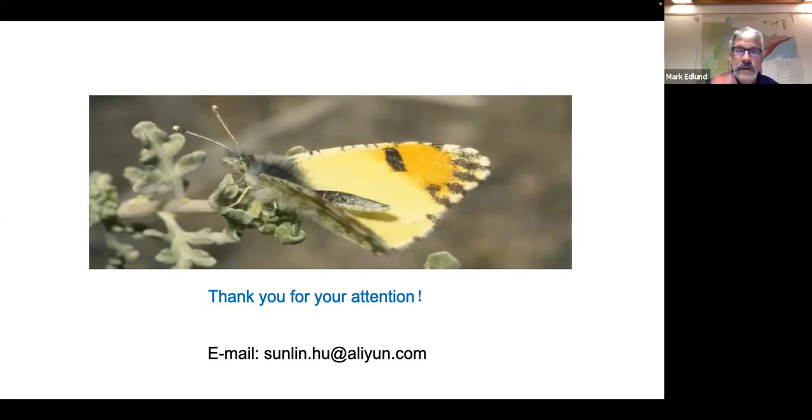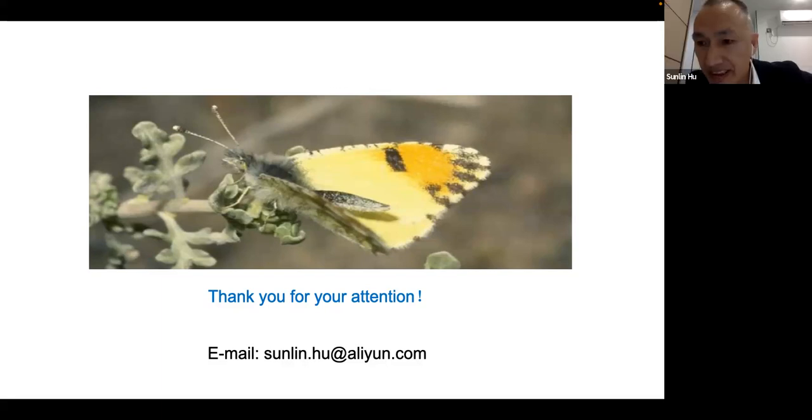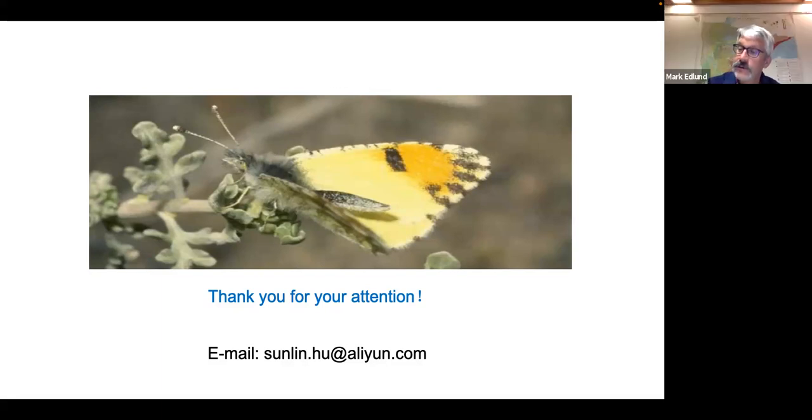Okay. Thank you for that. Can I just ask one more technical question? On the SEM preparations, are you sputter coating, putting a small metallic coating on the sample before analysis with your current SEM setup? Yes, to make it conductive. I was just curious if you were using one of the other types of SEMs at all. Okay. Well, thank you so much.